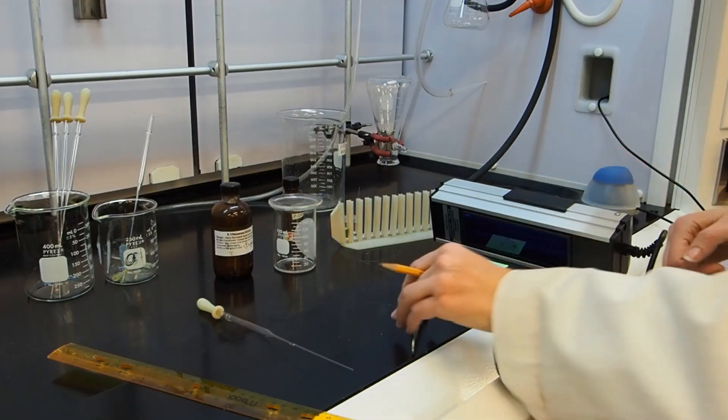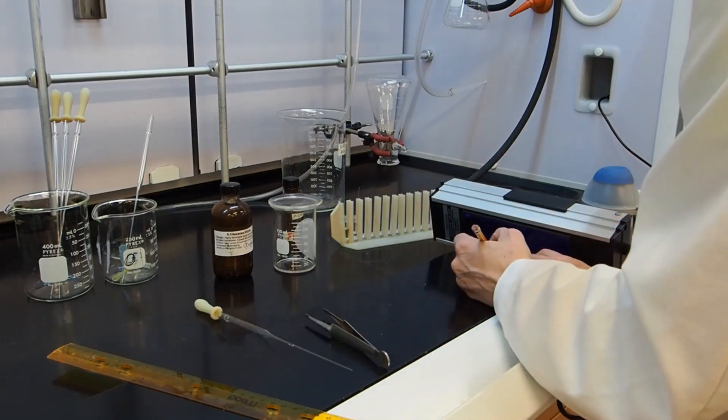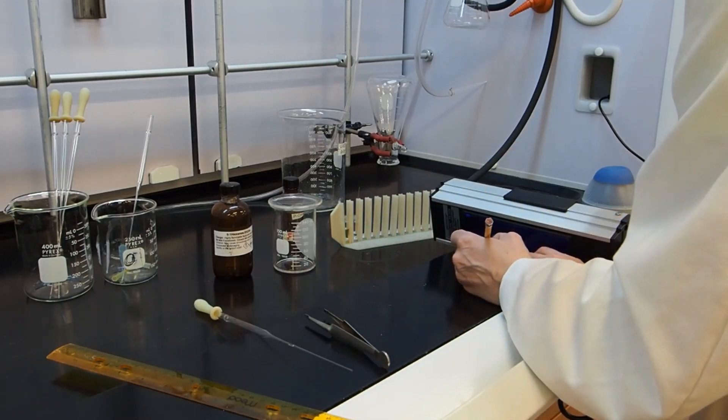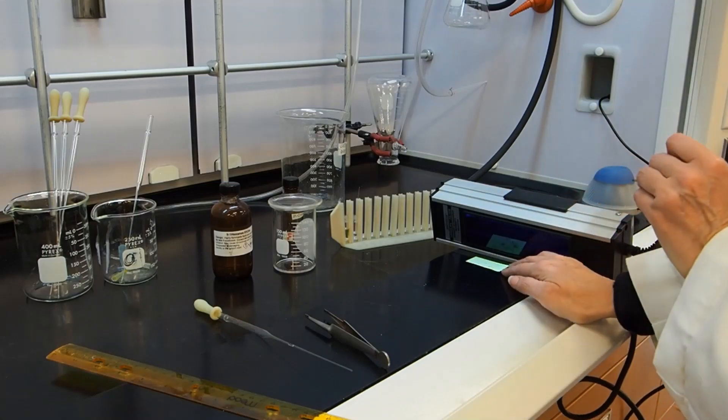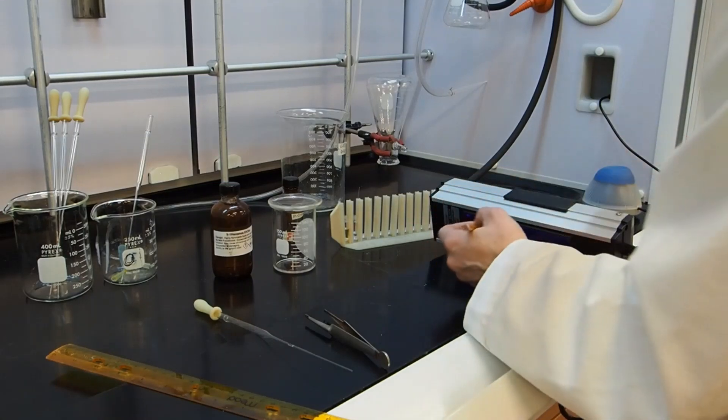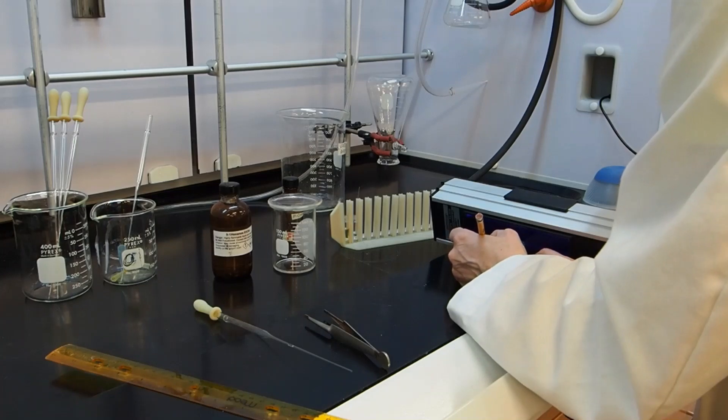That's because it's an alcohol. I can see there's a spot that's much higher on the plate where my reaction lane is. And then in the cross spot, I can see both of these spots.